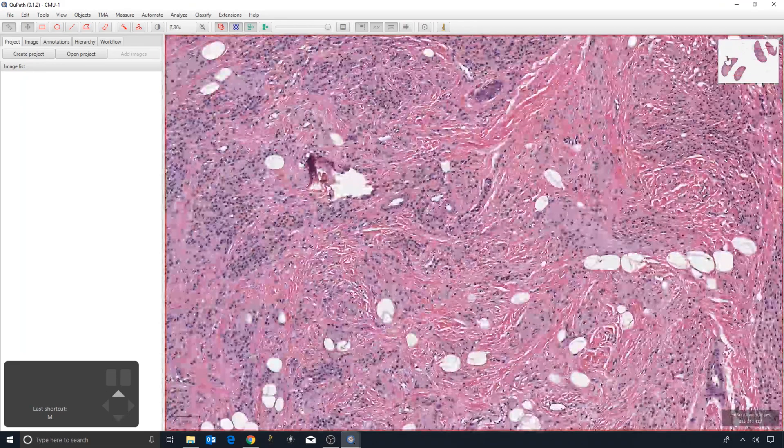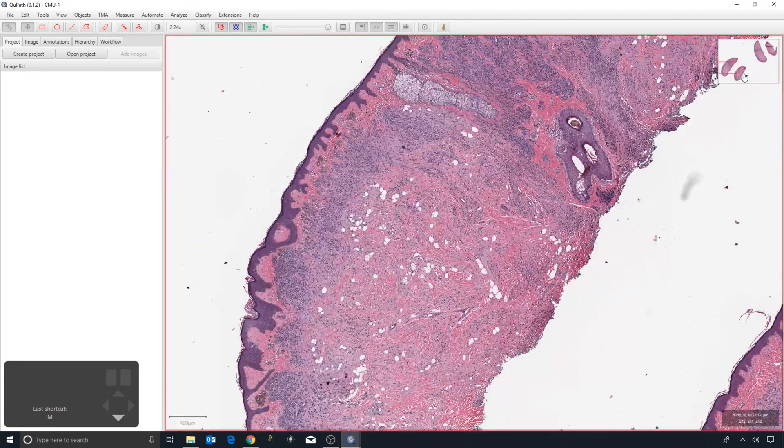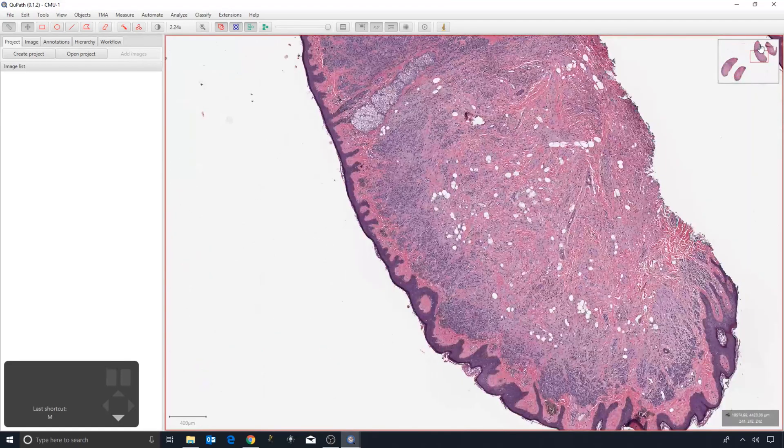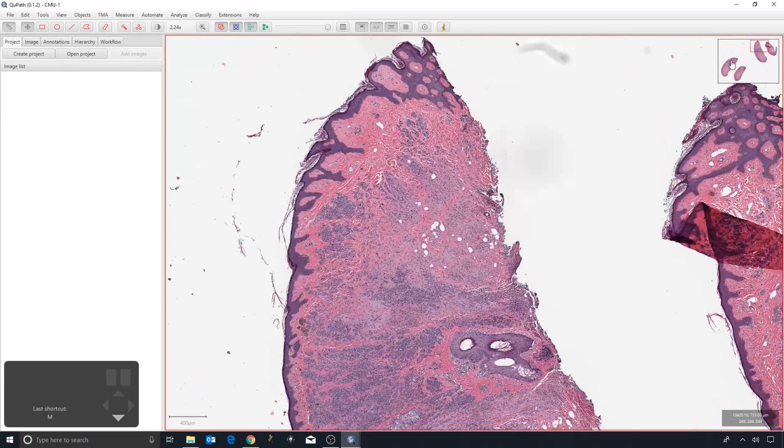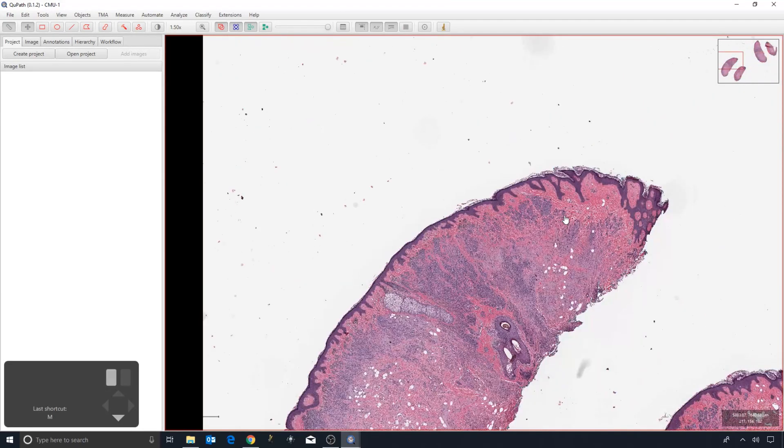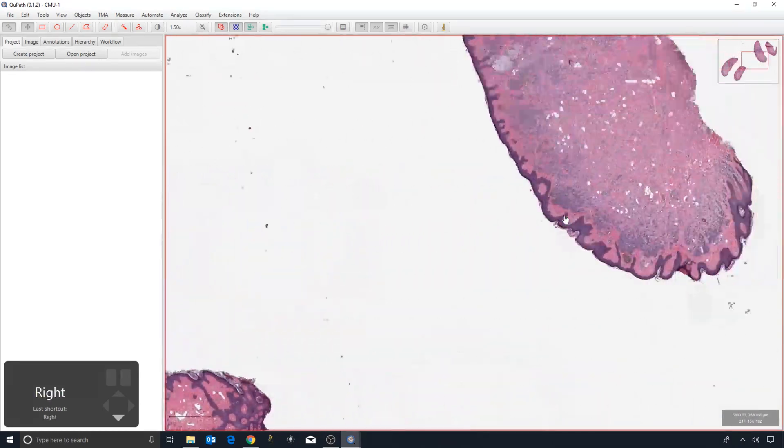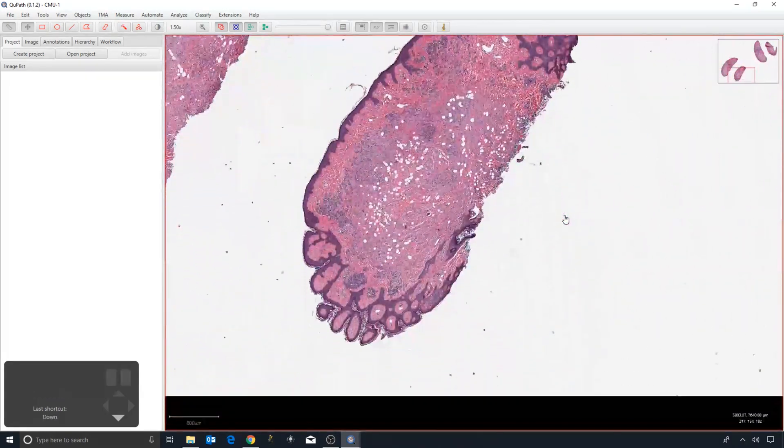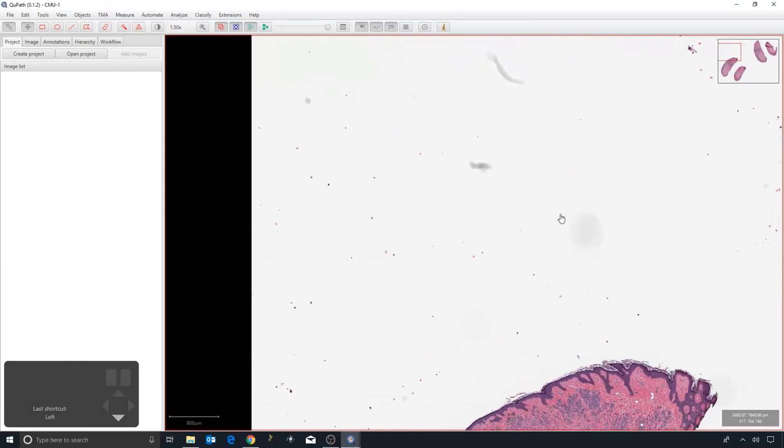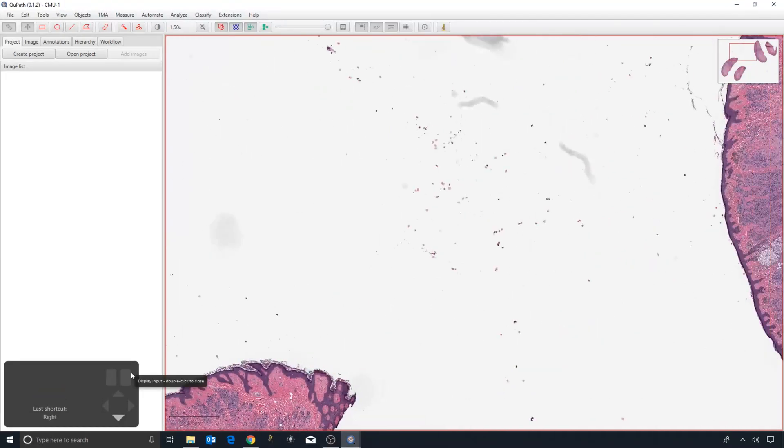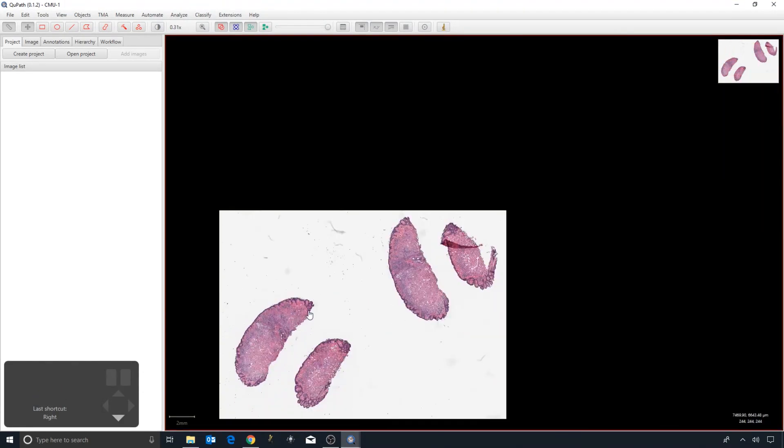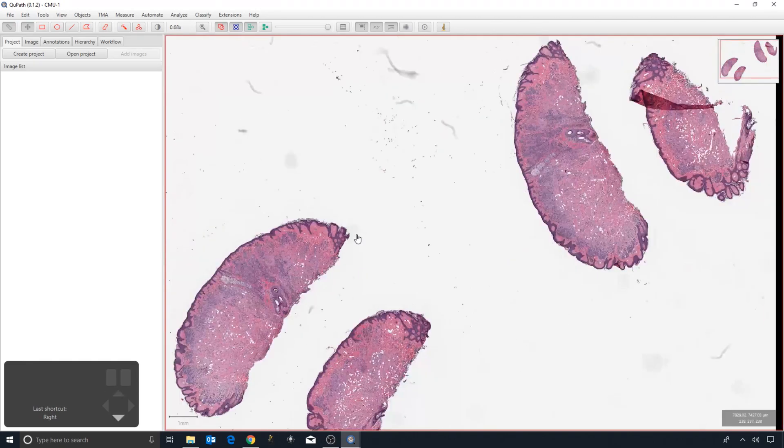Also, we can click on this little preview in the top right-hand corner to take us directly to a part of the image that we want. If you really wanted to, you could use the arrow keys as well, and you can see as I press the keys, they turn up in this bottom left panel.